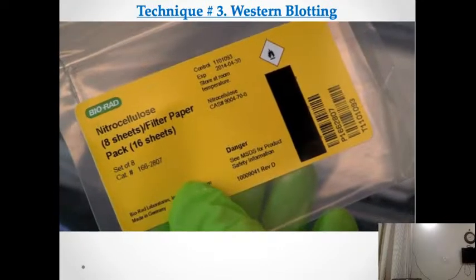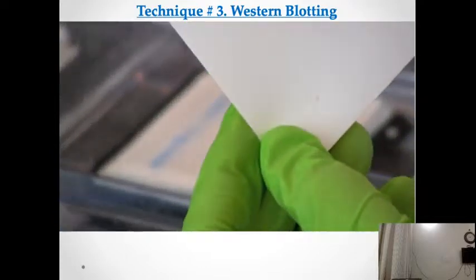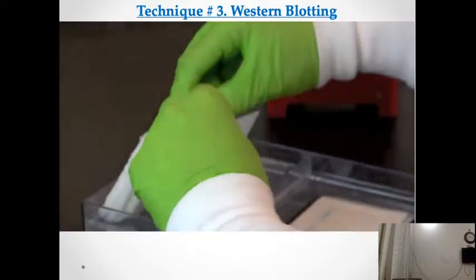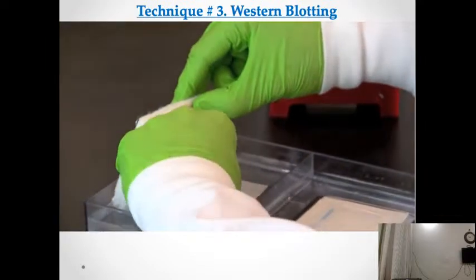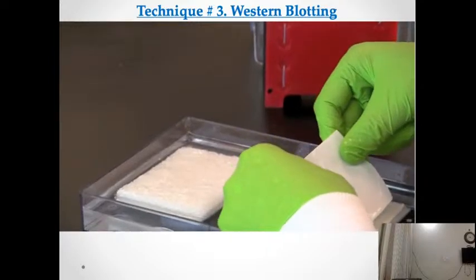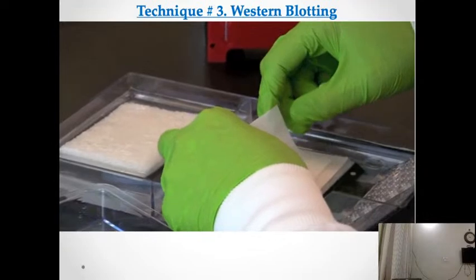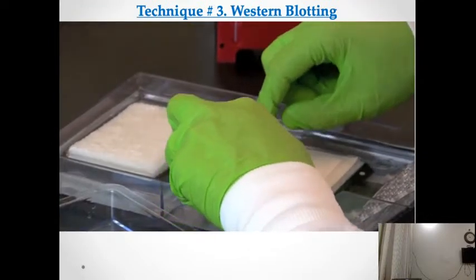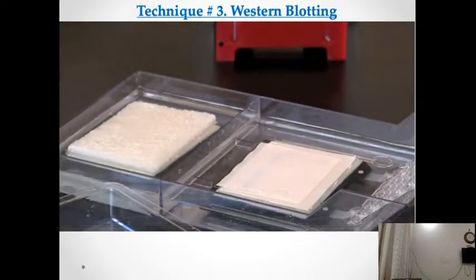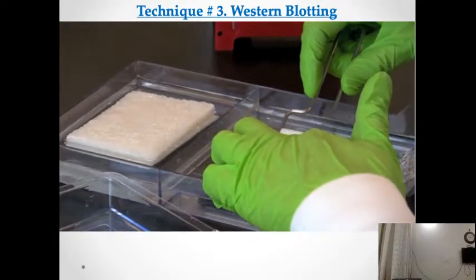Next, you will be applying a piece of nitrocellulose membrane. Remove the protective sheet from the membrane and wet the membrane with blotting buffer. Carefully place the membrane squarely on the gel. Avoid moving the membrane once placed on the gel, as proteins will begin to blot immediately. Using a roller, remove any air bubbles between the gel and the membrane.